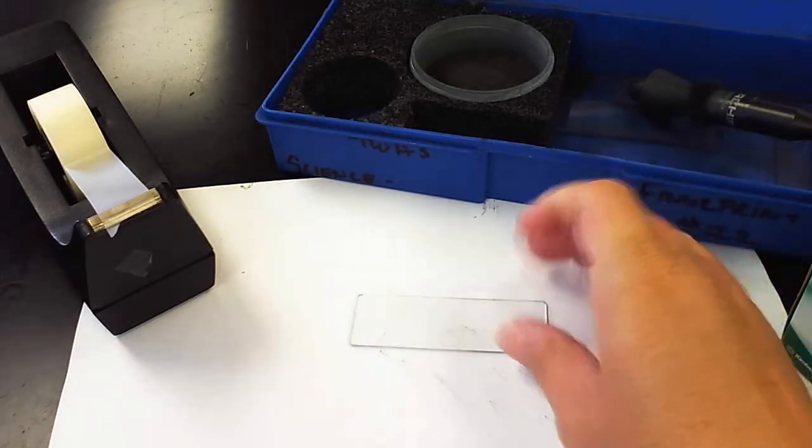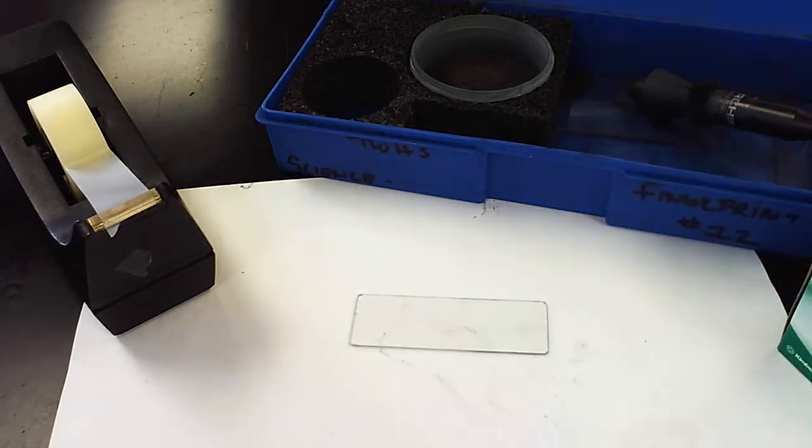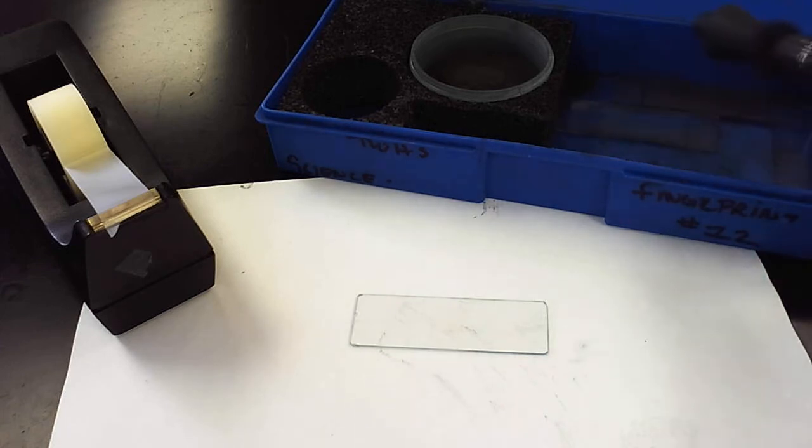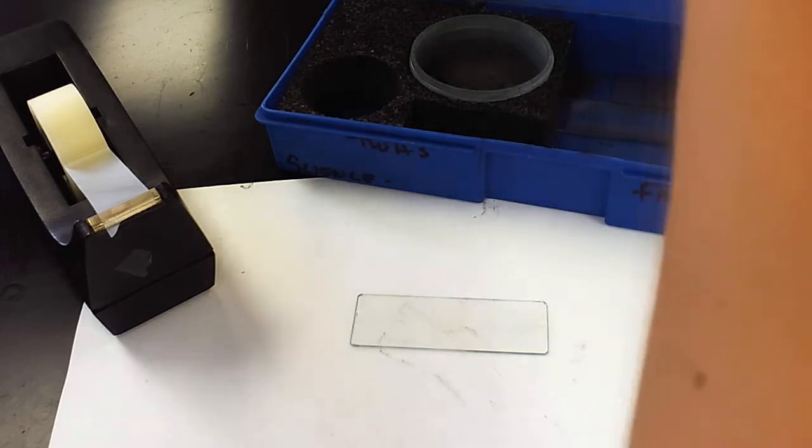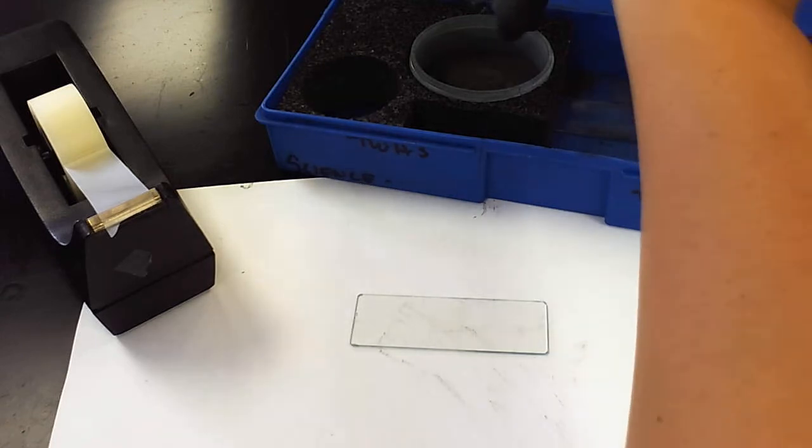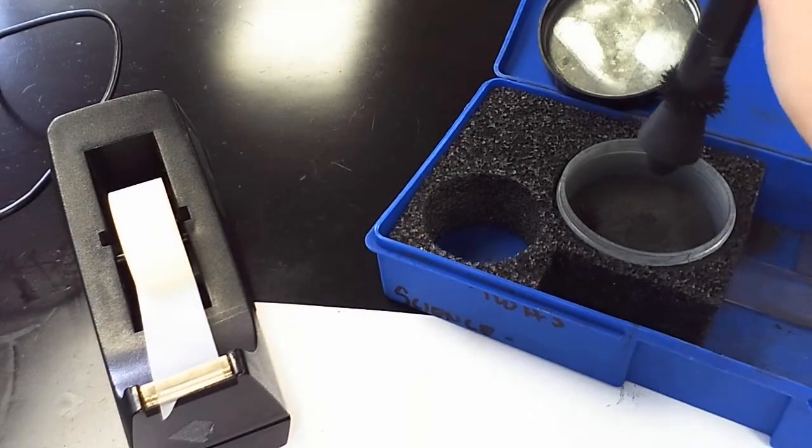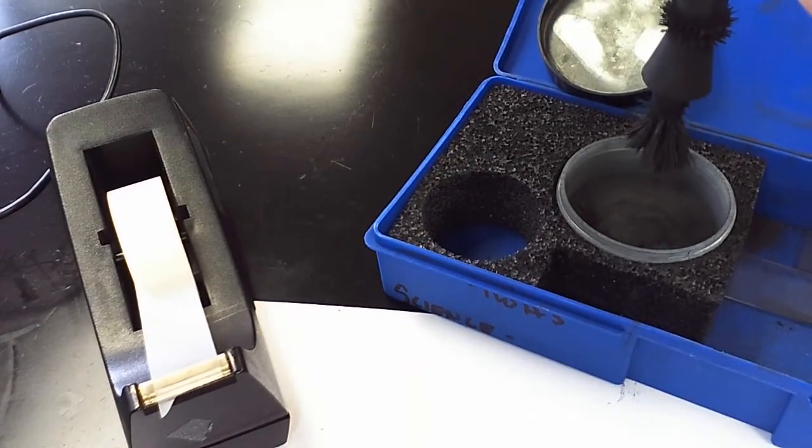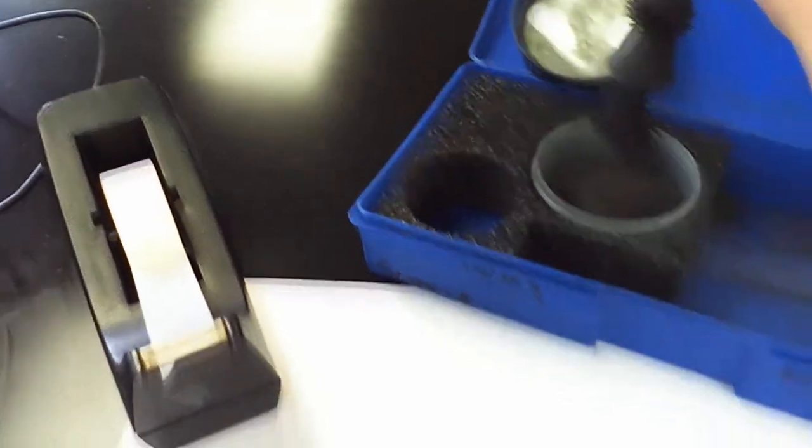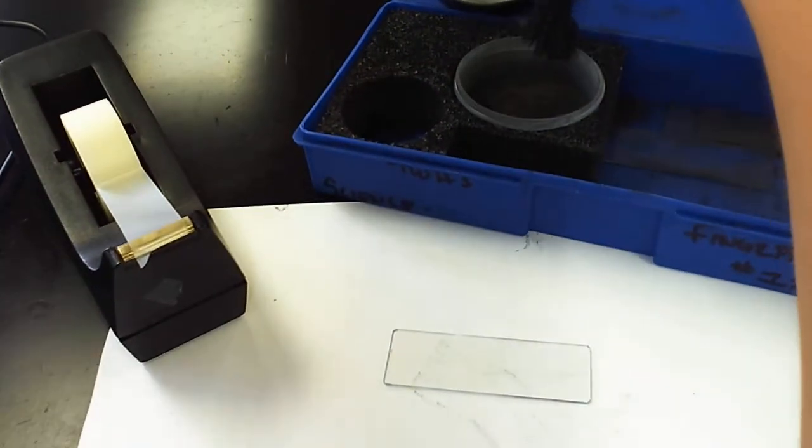So what we want to do is we actually want to lift that fingerprint off of the glass slide. And so to do that, this is where you want to practice, because this takes some technique and some ability. So this wand, you actually want to hover above the magnetic powder. When I hover it, you'll see it actually picks up the powder and becomes like a paint brush.